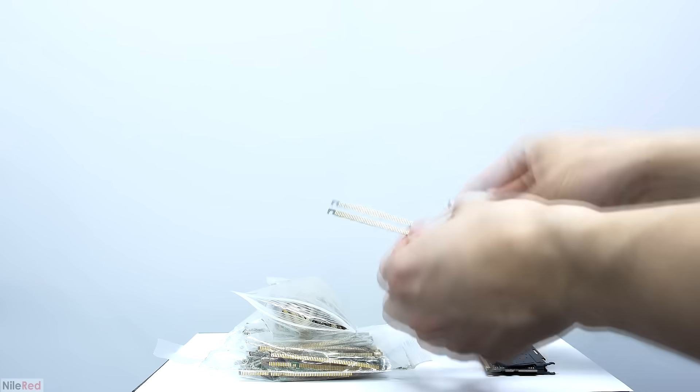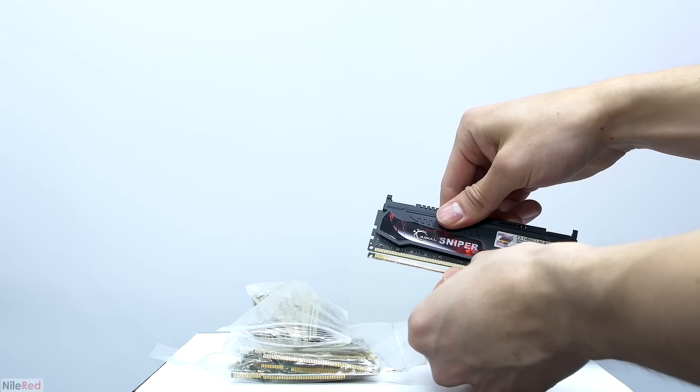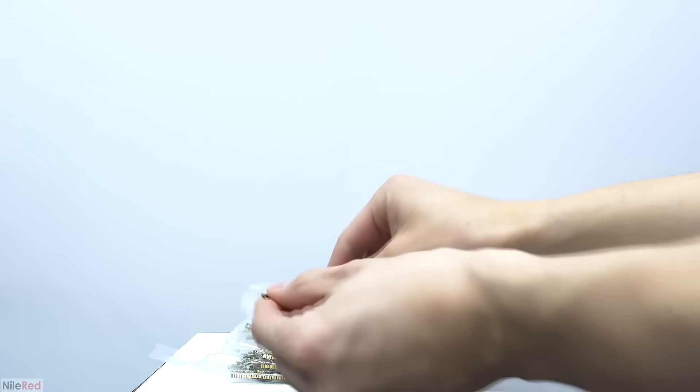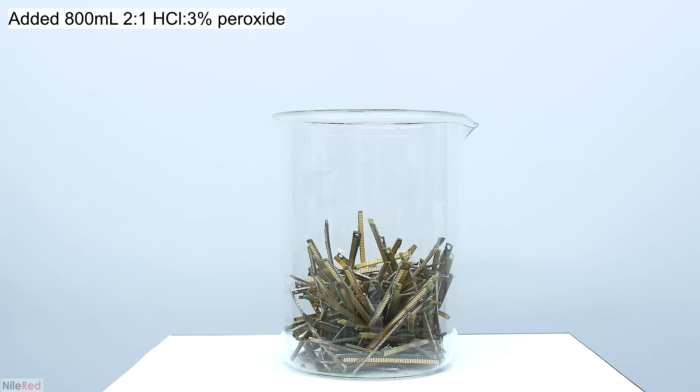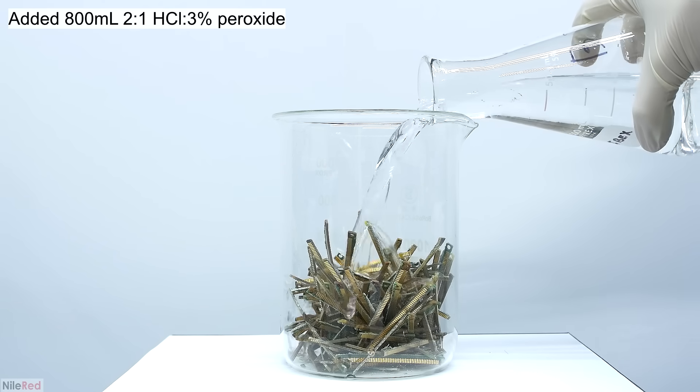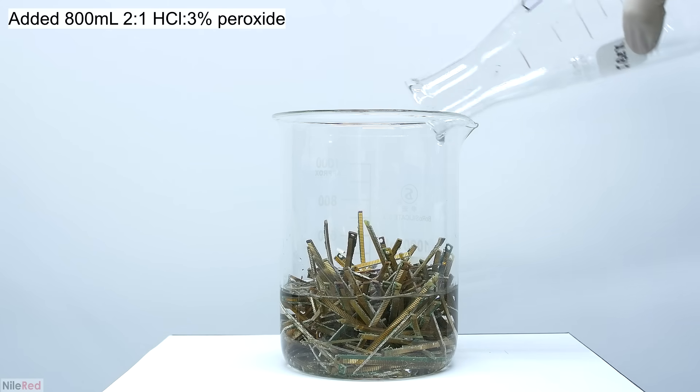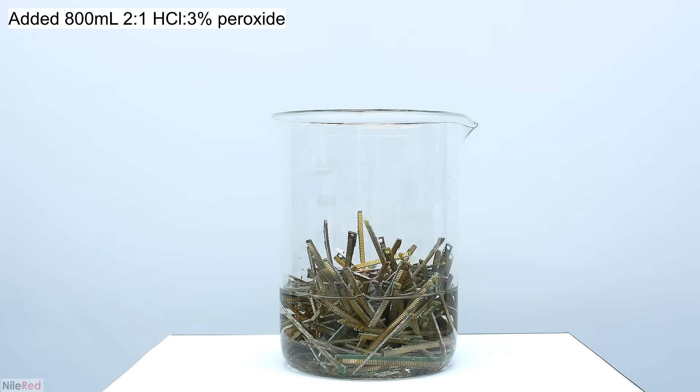Another popular thing to process are RAM trimmings, and I went ahead and bought about 200 of them. For those who are familiar with what RAM looks like, I provide an example here so you can see where the trimmings come from. Just like with the other stuff, we want to get the gold off of the RAM trimmings, and to do this we soak them in a mixture of hydrogen peroxide and hydrochloric acid.